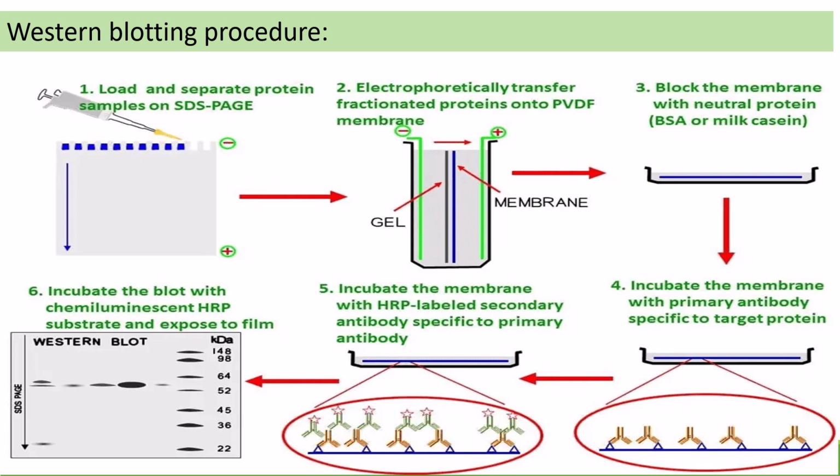Next. Okay, so here is the procedure. The very first step is sample preparation. In this slide, sample preparation is not written properly. So first, what they have done is start with SDS-PAGE, from which the visualization proceeds.